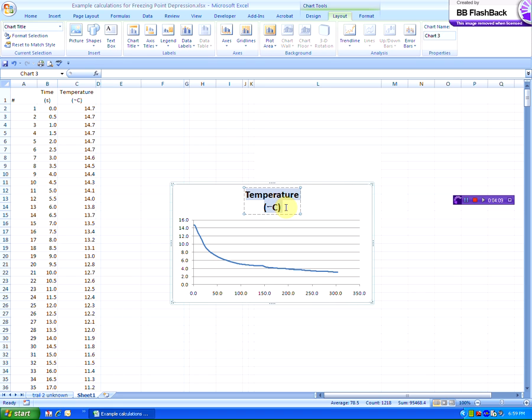We're going to call this Experiment 2, trial number C2. I'm just using the C to represent the unknowns. This is the third type, and 2 means that this is my second trial of doing this data. I'm also going to make sure it's clear to me: unknown mixture.